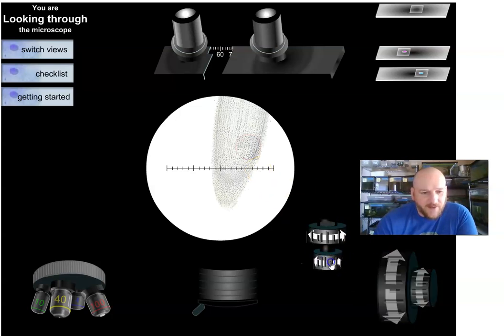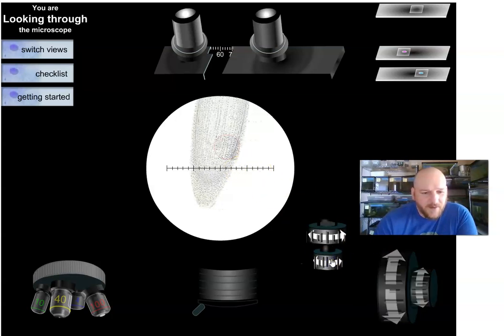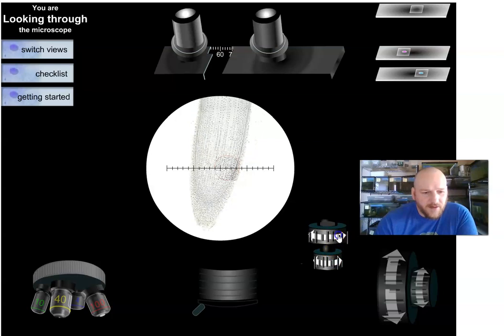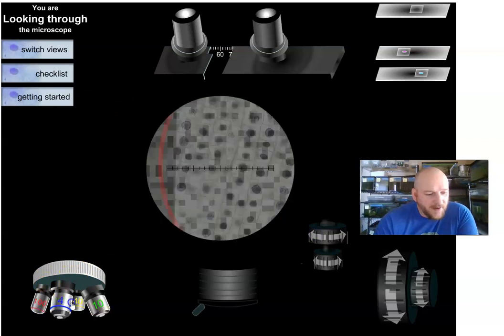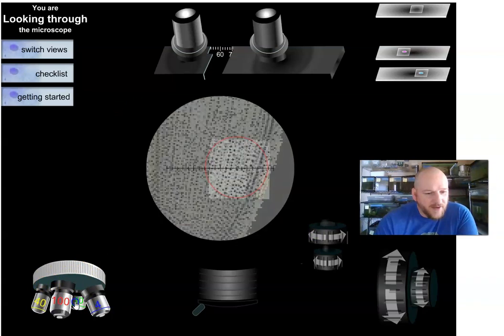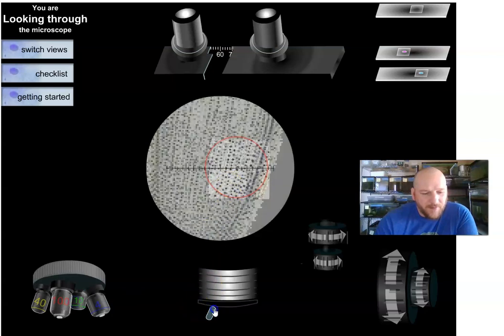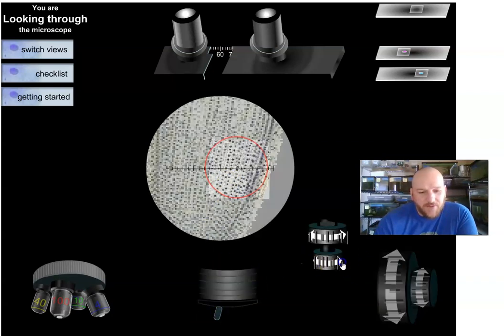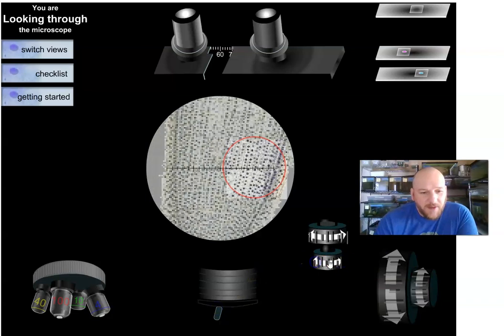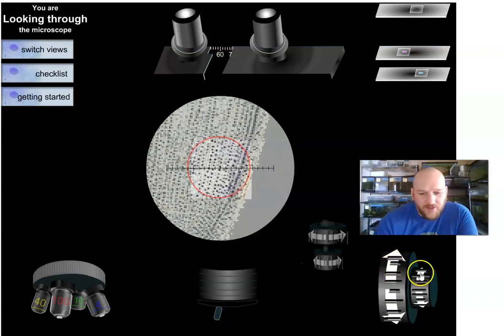Let's go ahead and center that a little bit and zoom in on our onion root. Once we have that we can crank up our magnification if we want. A little hard to put it in the right spots but magnify it when we open our diaphragm a bit. Again this would all be good stuff for the students to play with. It's just basic microscope use and a chance to do some adjustments.